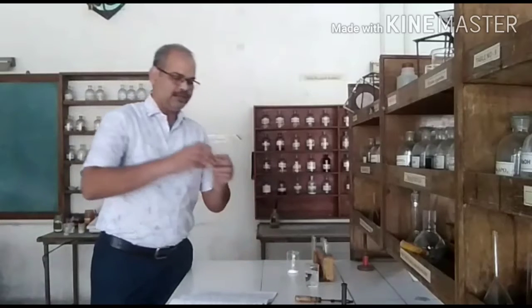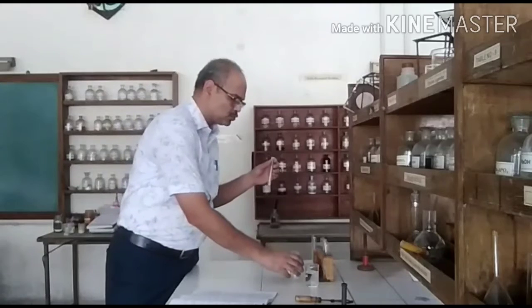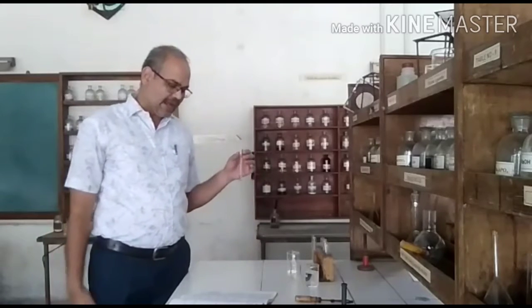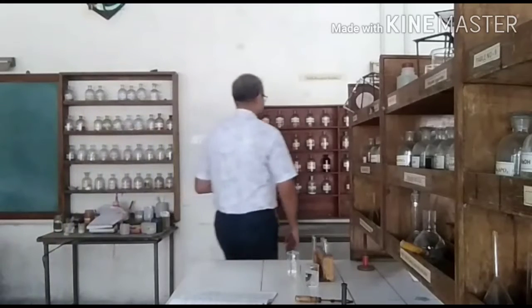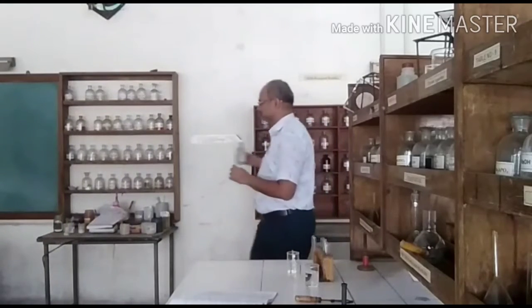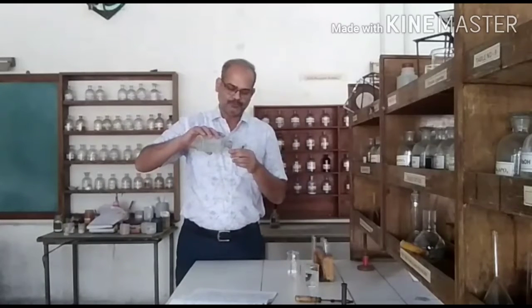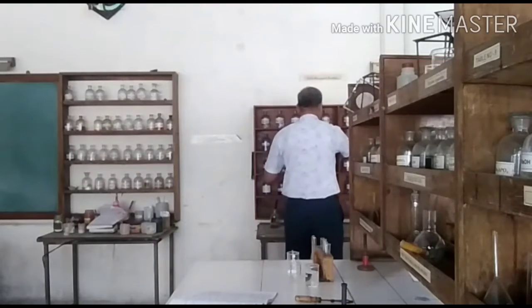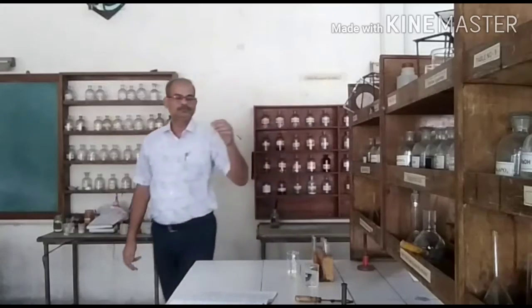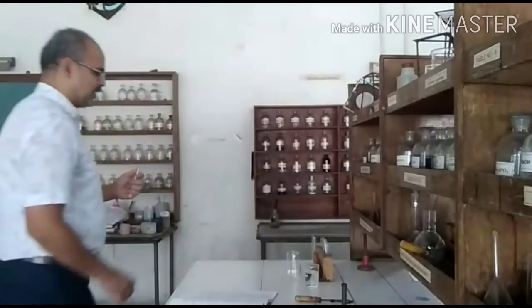So first, in a test tube, I will take a small amount of OS. In that I will add lead acetate. Where is lead acetate? Again on the side rack. So this is the bottle of lead acetate. I will add lead acetate to this test tube. I will keep the bottle back in its place. Can you see this is white color? It is not as transparent as water. So there is a white precipitate.